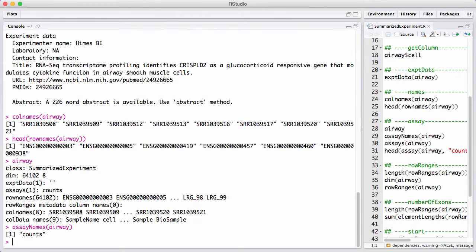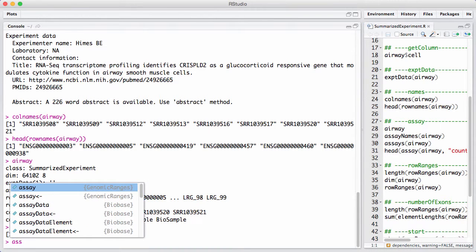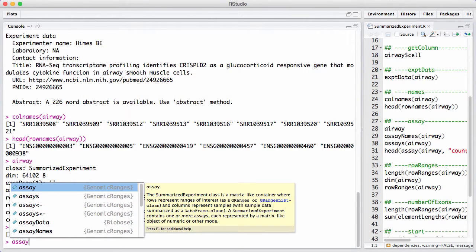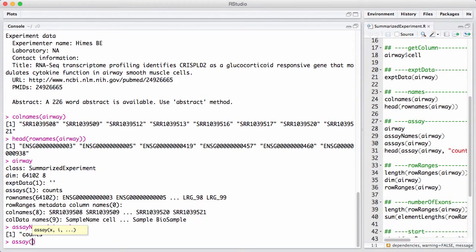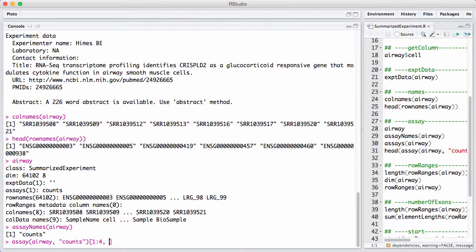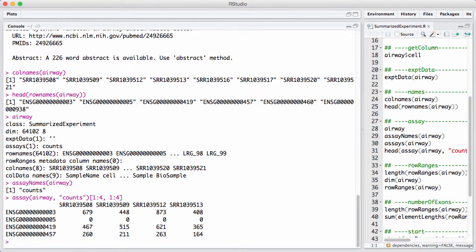To extract the data, we say assay(airway) and give it the name of the assay we want to extract, which is counts. This is going to be a big matrix, so I'm going to subset it to just get the first four genes and the first four samples. This is RNA-seq count data.